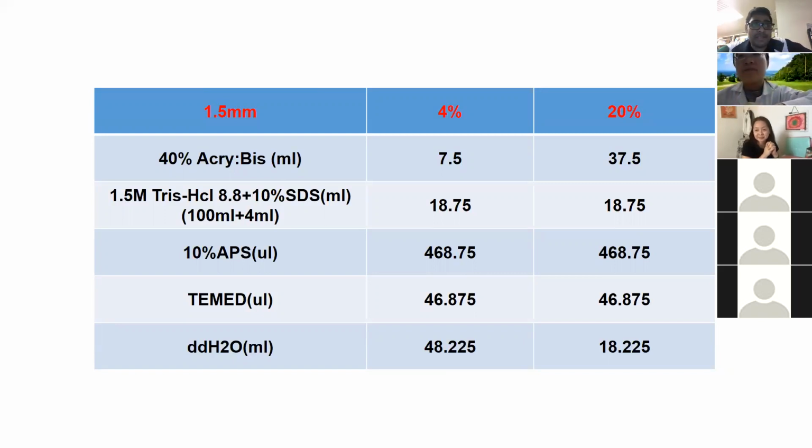Postdocs and lots of students feel pressure from the PIs when practicing with commercial gels. But for this one, you can try as many times as you want, and it's okay. We're just practicing.